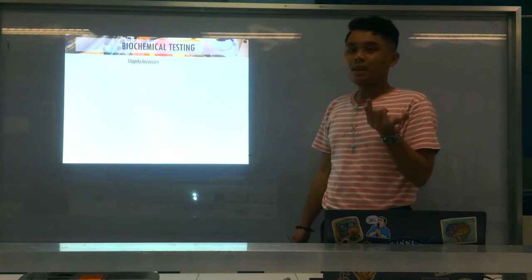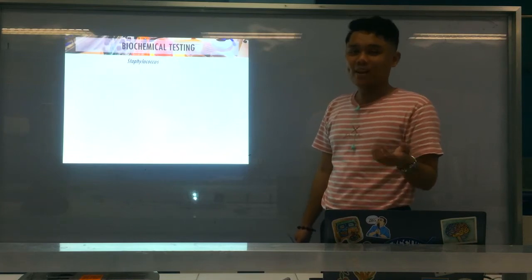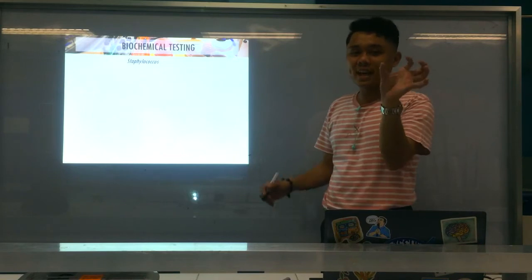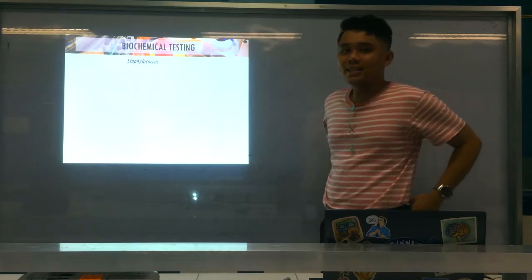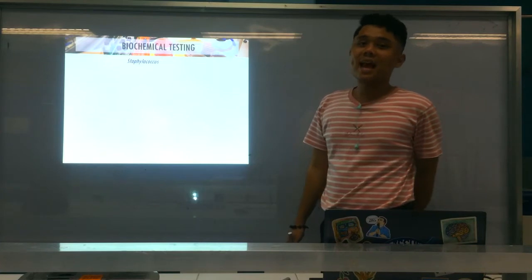Next, bacitracin susceptibility test: is it susceptible or resistant? It's resistant, therefore what is its zone of inhibition? It's 6 millimeters, because if our organism is resistant, the diameter of the disc is what we measure. Okay? And lastly, for the modified oxidase test, what is the result? Positive or negative? It's negative.